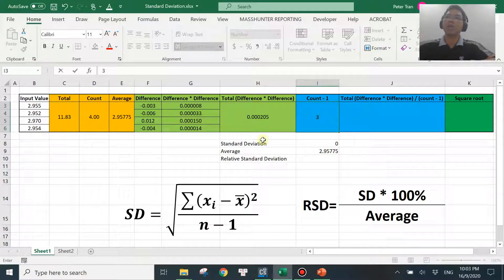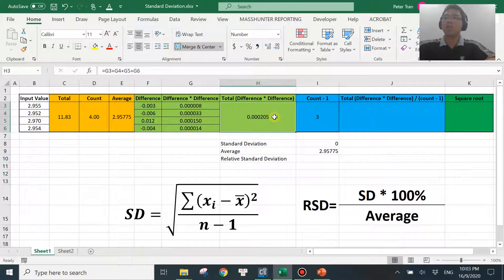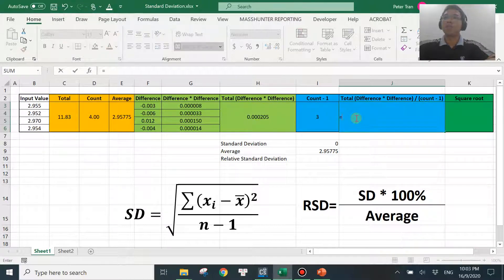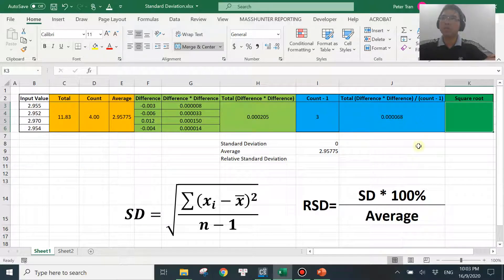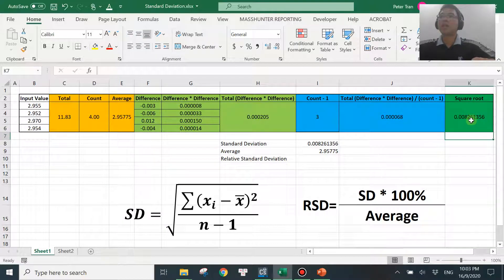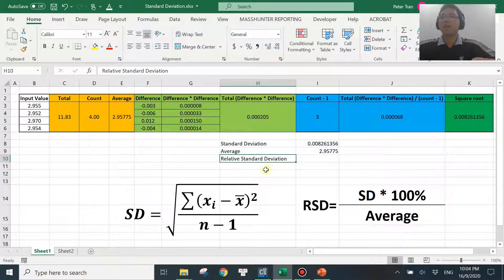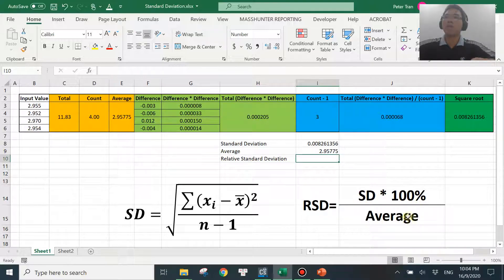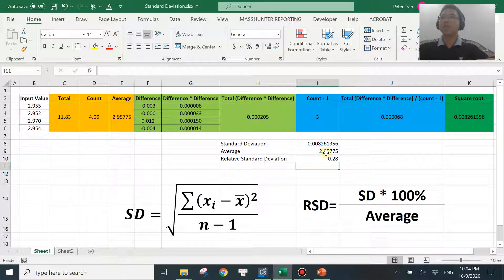Then you want count minus one, which is n minus one. We have four, so that will be three. Then you divide the sum by n minus one — this value divided by this count minus one. The last step is to take the square root of that value, using SQRT. So this is your standard deviation from the manual calculation. Standard deviation is here, average is here. Another very useful term is relative standard deviation, which is standard deviation times 100 divided by the average, expressed as a percent.